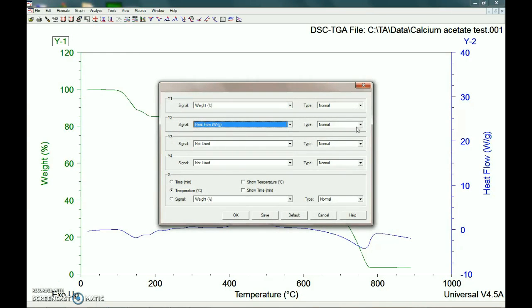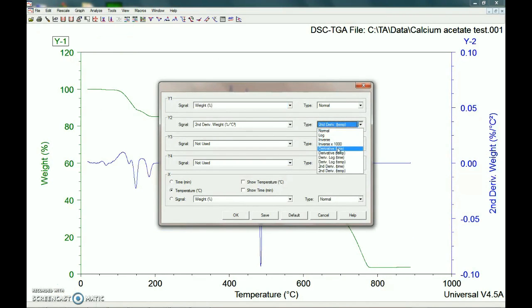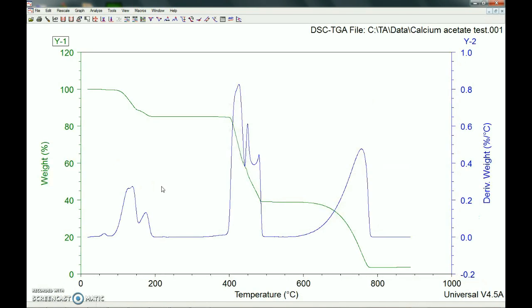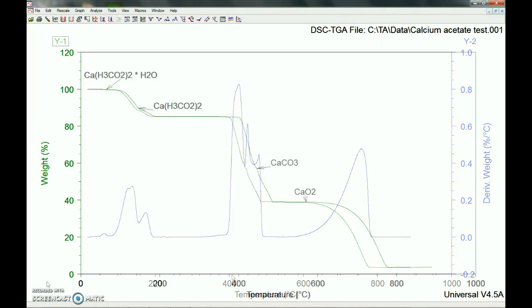So let's see what else we can look at. We can go and you can change the type of graph. The different derivatives can be useful. So let's go ahead and look at the first derivative of temperature. So that'll show us a little bit more defined of when the weight is changing the most per temperature.